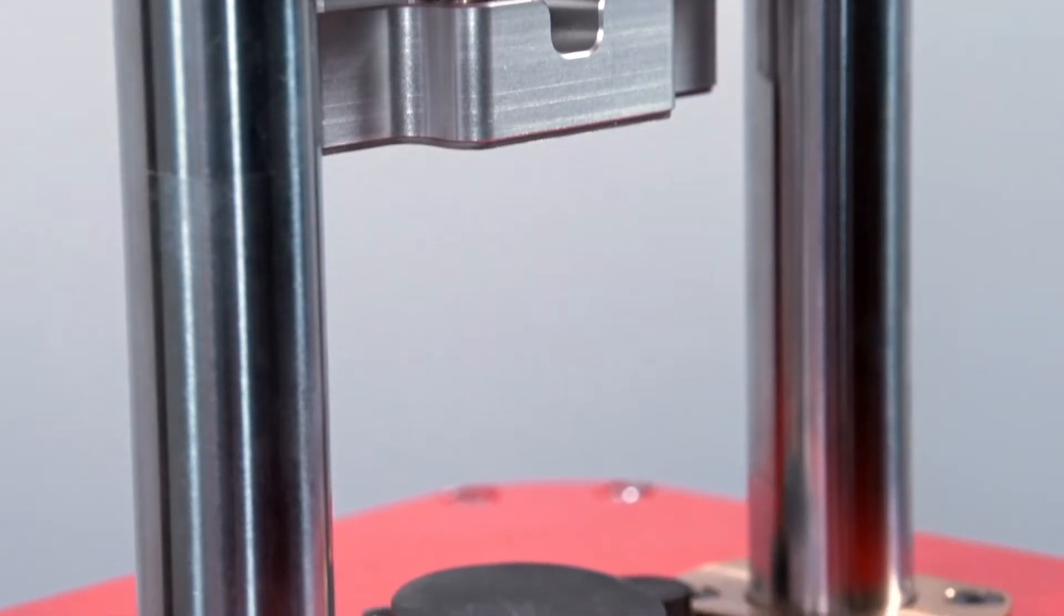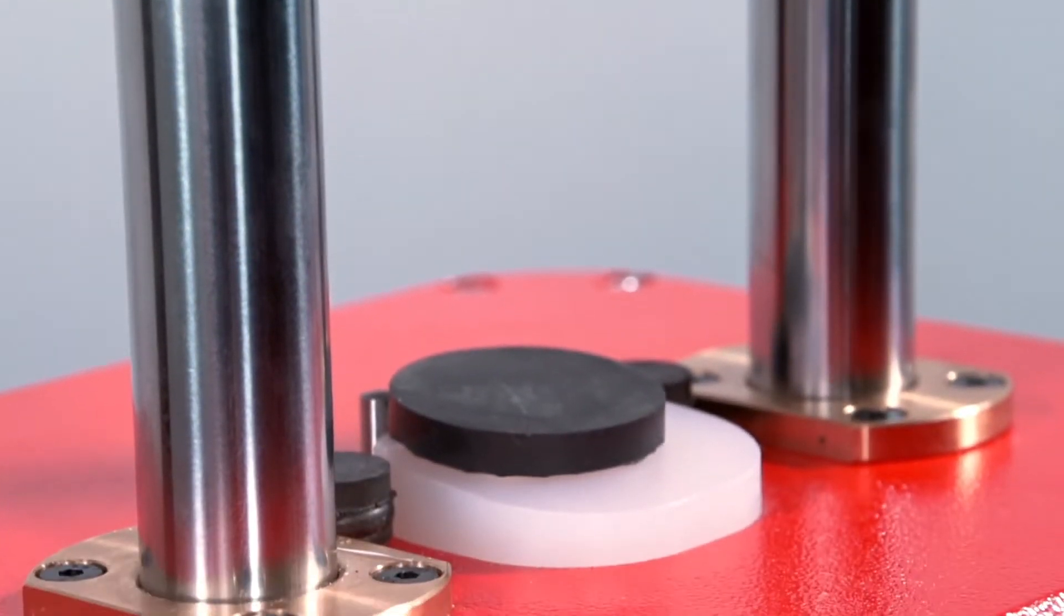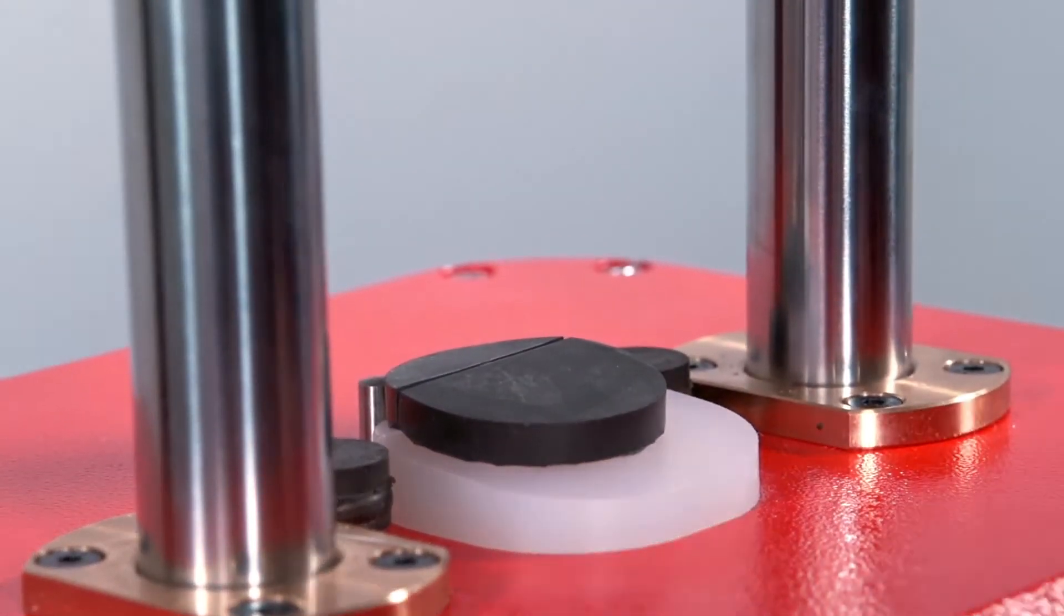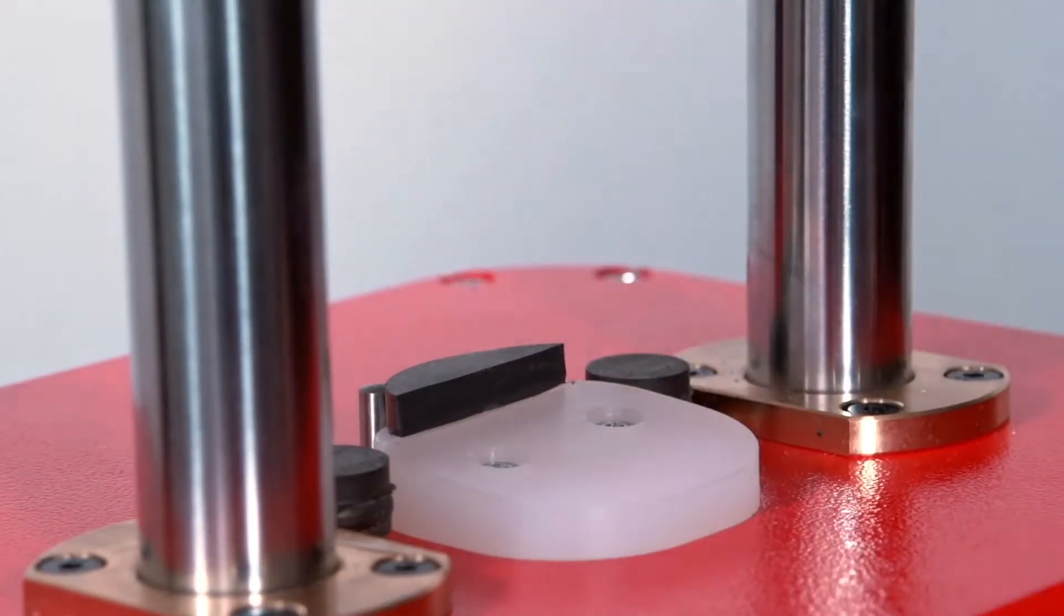In order to achieve an optically flat surface, the DisperCut features a high-speed close-and-cut system which simultaneously stretches the sample while applying a consistent cutting force, guaranteeing a cleanly cut test specimen with a surface free of smearing and contamination.